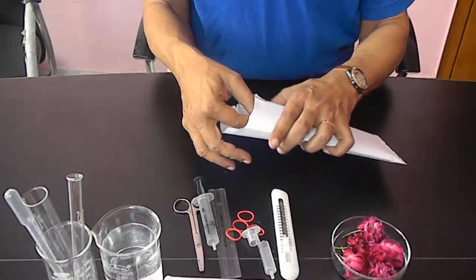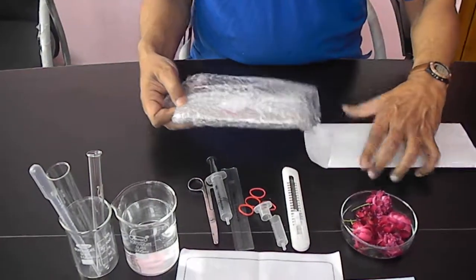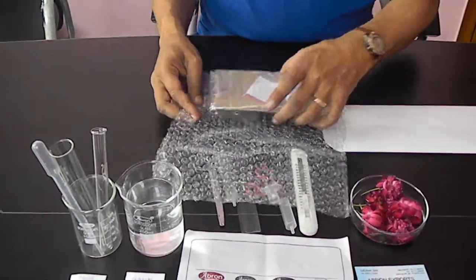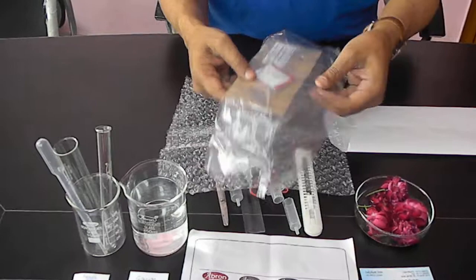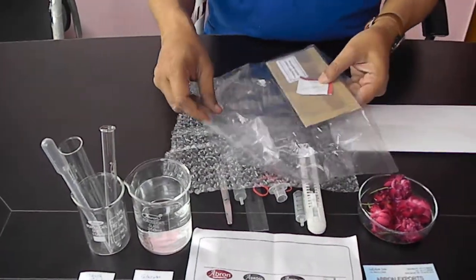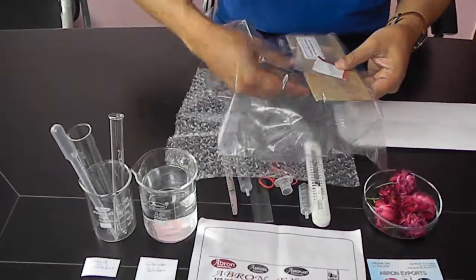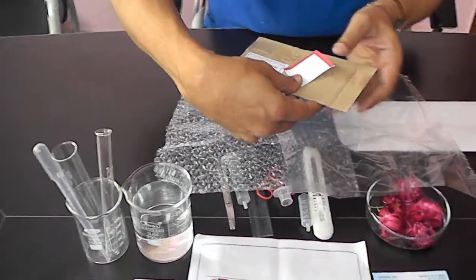To open the packing, you'll find it comes with bubble wrap, then a plastic pack, and inside is the whisking tube wrapped in paper.